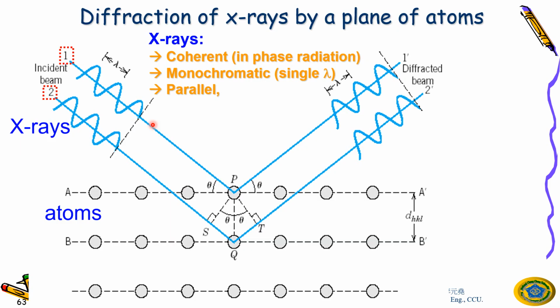Laser. Okay, so the laser goes through this, and these are the atoms on the surface. If you have a parallel X-ray going through in this direction, you will have diffraction, right? Diffraction here, and it can be constructive interference. It can be destructive interference.